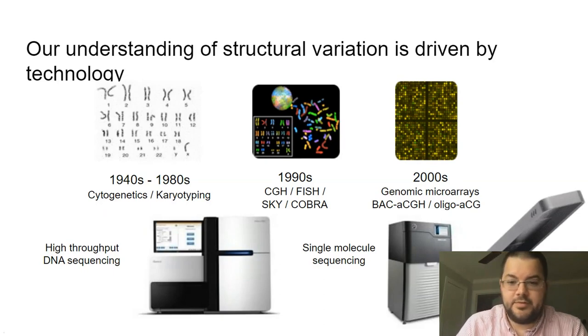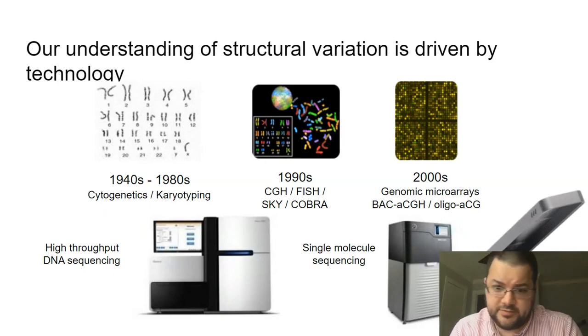And then in the last couple of years, really, I would say in the last 3 to 5 years, quite frankly, we've seen advances in long-read technologies such as the PacBio Sequel II that can produce high-fidelity reads, HiFi reads, with incredible accuracy at 15 kb to 20 kb length, or with Oxford Nanopore, I'm just showing here a MinION machine, but a PromethION is more what we are using in this study here, that can produce very long reads with approximately an error rate between 3 and 8%, and upcoming updates even lower than this.